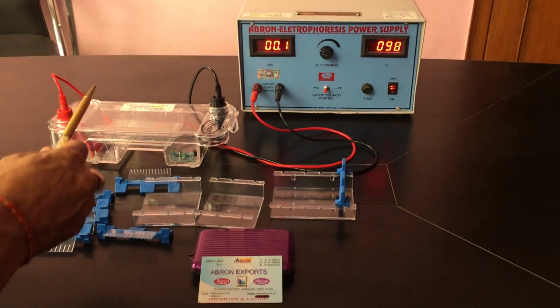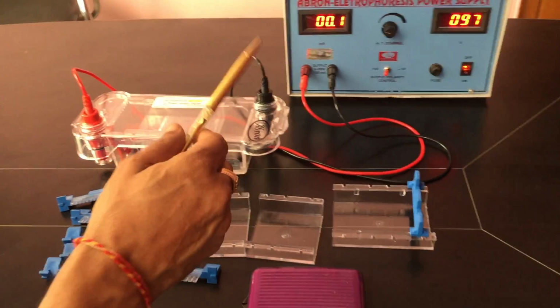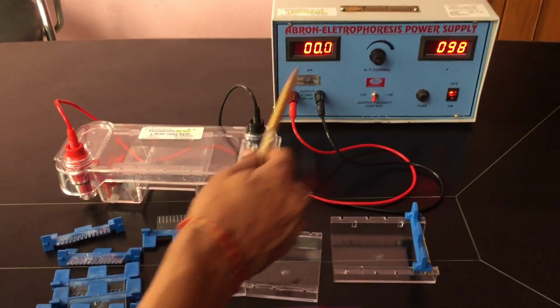ये हॉरिजॉन्टल जेल इलेक्ट्रोफोरेसिस है, हमारा जेल. This is the horizontal model of gel electrophoresis apparatus.